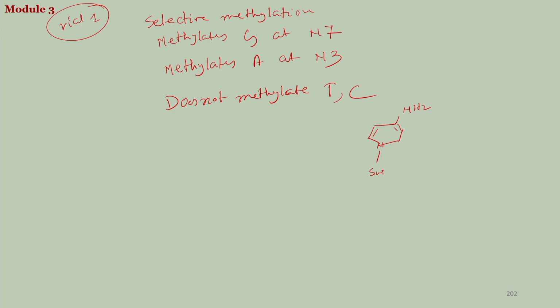Here is your sugar, and here would be the carbonyl.